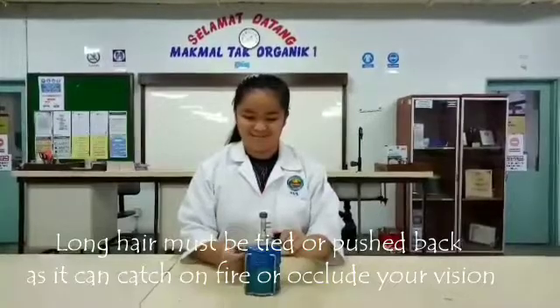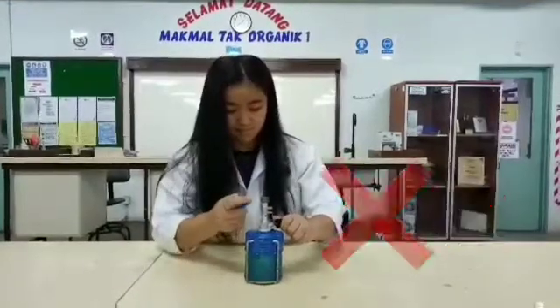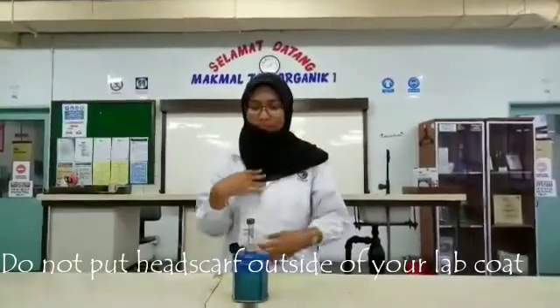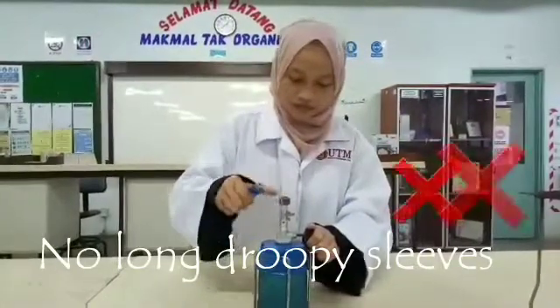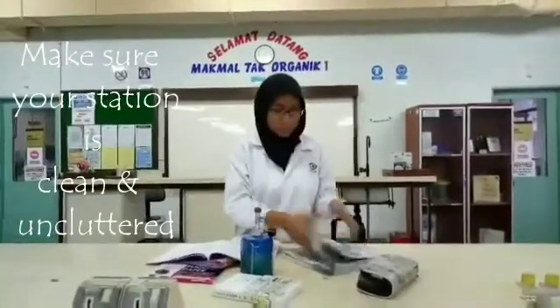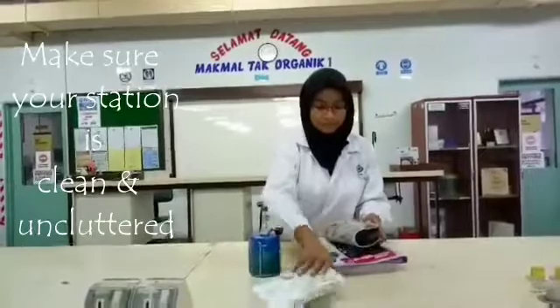These are the safety precautions for the Bunsen burner. Long hair must be tied or pushed back as it can catch on fire or occlude your vision. As for headscarf, it must be put inside the lab coat — do not put your headscarf over your shoulder. Long droopy clothes should be avoided; if you happen to be wearing one, tuck it inside your lab coat. Make sure your station is clean and uncluttered. Put away books or papers that might pose a fire hazard.